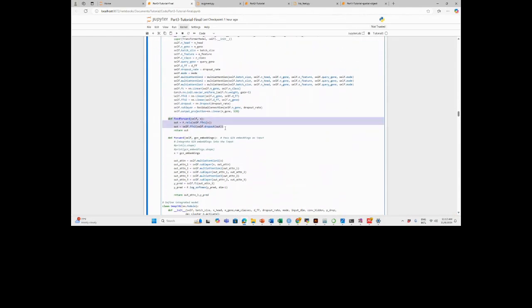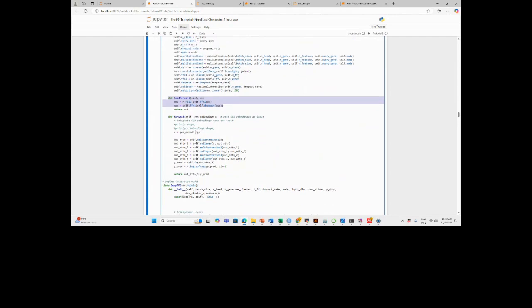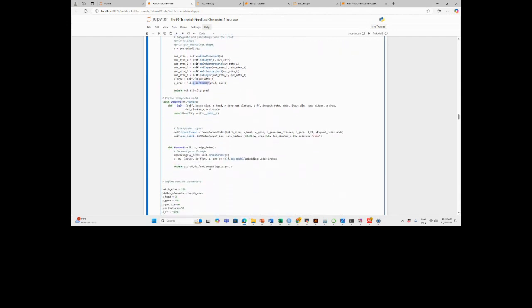Then this is just going to feed forward to save our output whenever we get the embeddings, so we can extract them. When we say forward, for X we're going to have the GCN embeddings from the graph convolutional autoencoder. Then for the transformer, we call the multi-attention layer, again multi-attention. At the end, we apply softmax so we can identify the different cell types. And here we tell it the order. Here are all the parameters that we need to input.